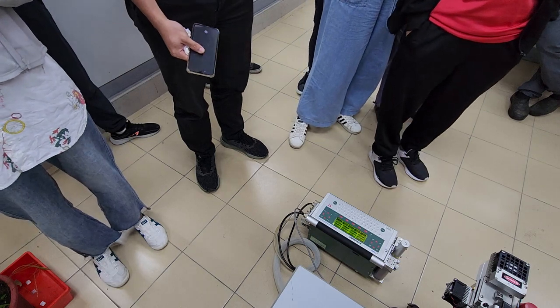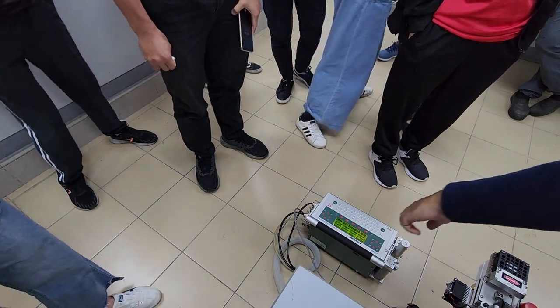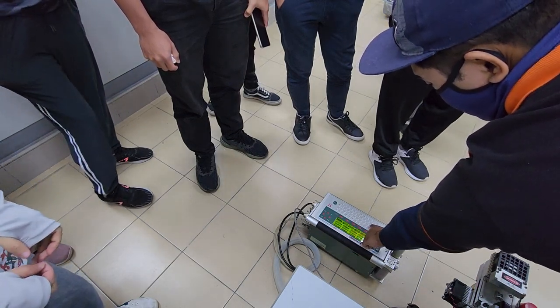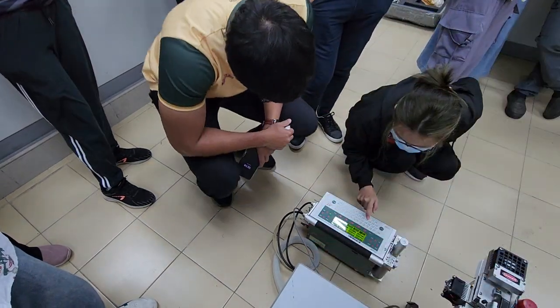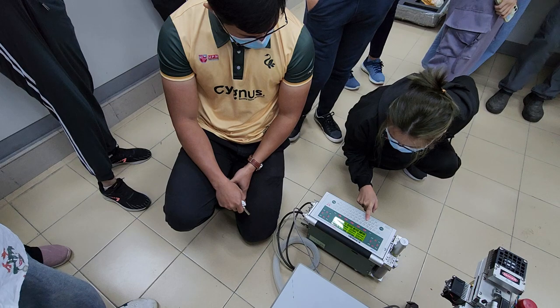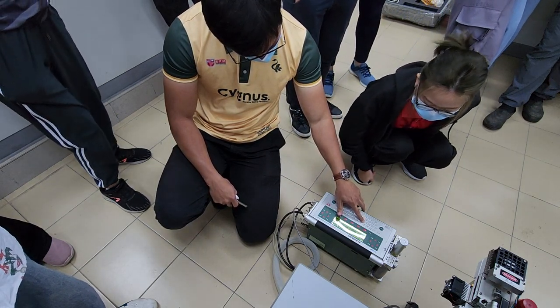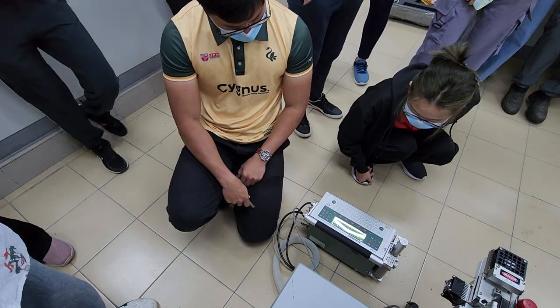So is there anything that is very portable? Yes, but you don't get lots of reading like this. This is only one screen. If you change the letter to C, you get different things. D, E. There are many data. So when you press the log, you actually get data from 40 parameters minimum. Temperature, light, yeah. So that's the conductance. Ci is the intercellular CO2.